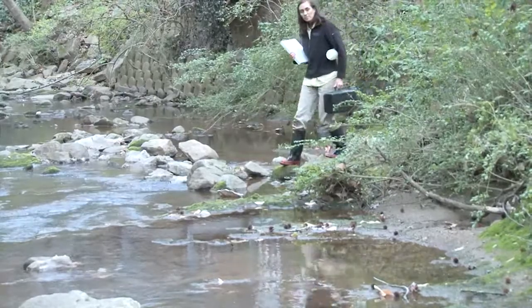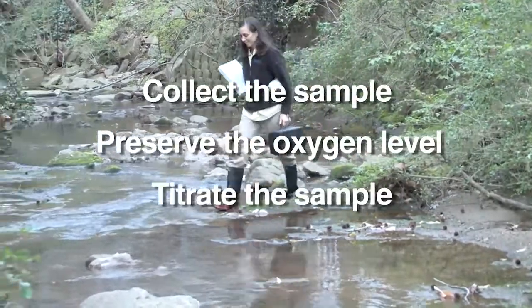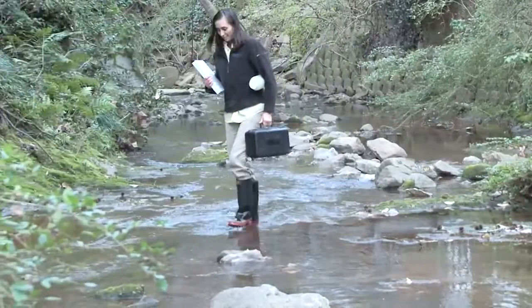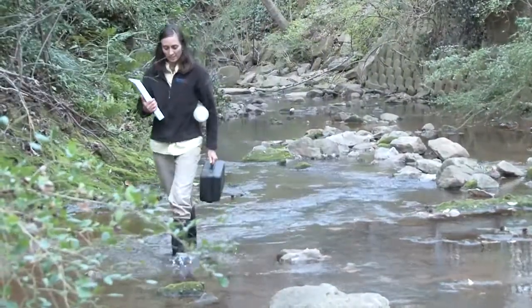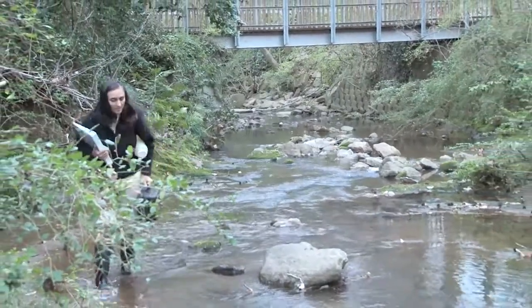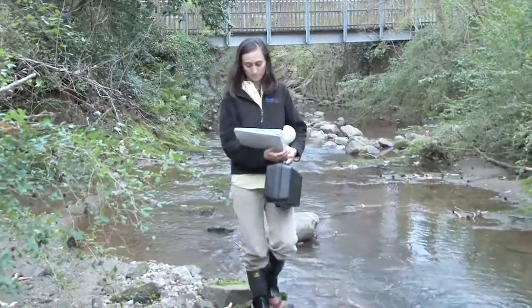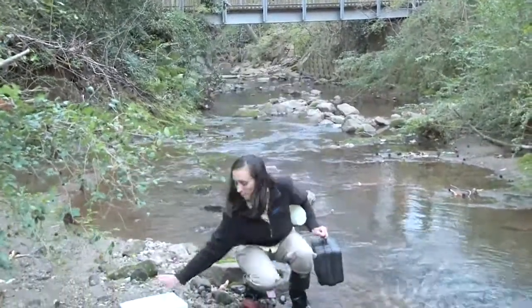Terra Mintz is going to demonstrate how to collect the sample, preserve the oxygen level, and titrate the sample. We chose this site because it is a representative segment of the stream range. It has legal access, and it's easy, safe, and wadeable. She chooses a safe spot on the bank to lay out her kit.